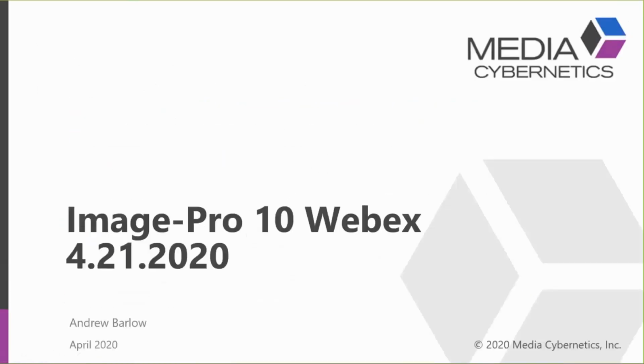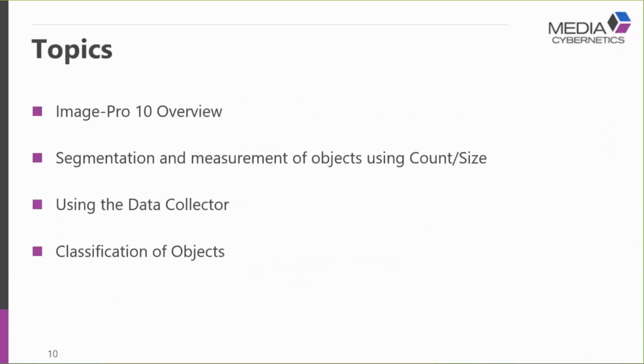Okay, so thanks for joining us, everyone. This afternoon I'm going to go through a quick introduction to Image Pro, followed by discussing segmentation and measurement of objects using count size. Then we're going to look at using the data collector, and we're going to finish off with classification of objects.